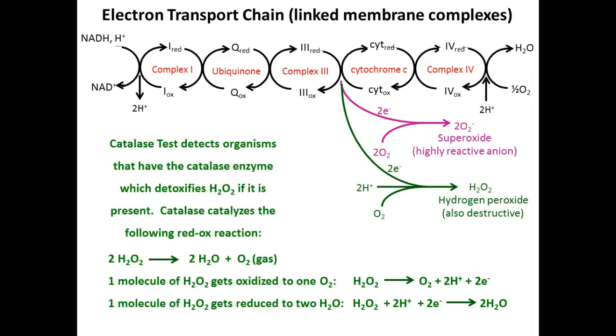So all of our organisms bubbled except Grace's, right? Because is Grace's organism using aerobic respiration? No. So guess what? She doesn't need catalase. She's not making hydrogen peroxide. Make sense?